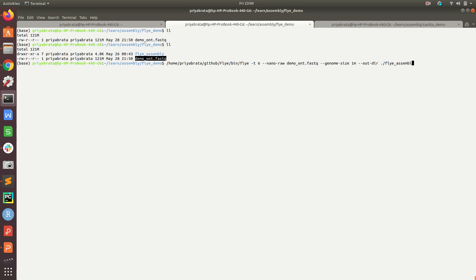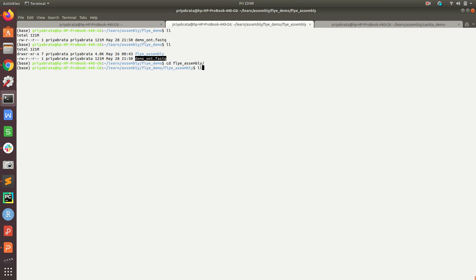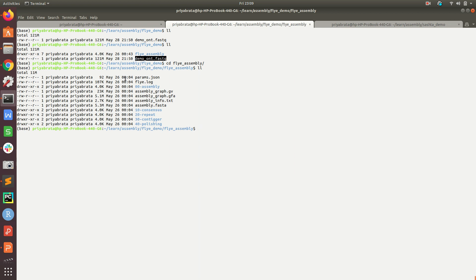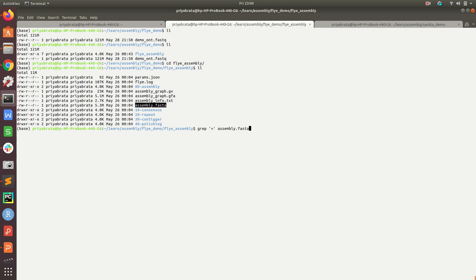This will take some time to run, so I have already run it before. Let's go to the directory. This is the output folder. You can see many folders, but the important thing is this assembly.fasta.